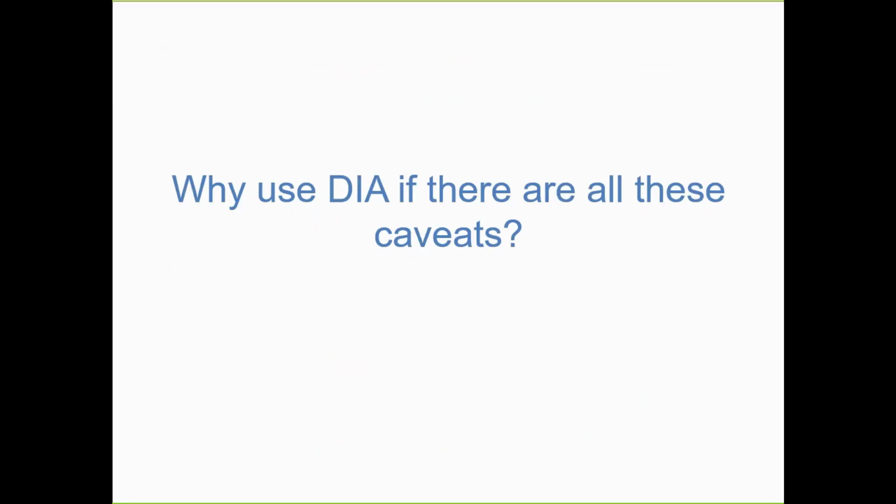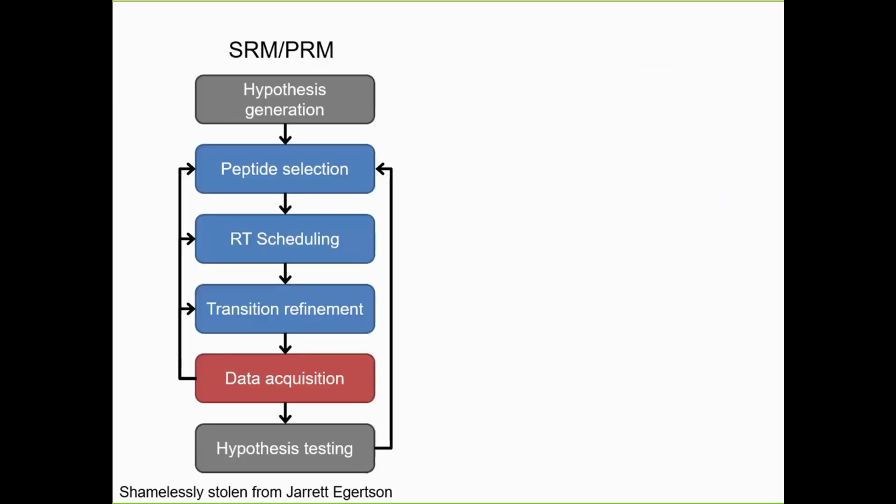So you might wonder, why would we recommend that you consider DIA at all if there are all of these caveats to doing the data acquisition? And I think you need to consider this from multiple perspectives. The first is, why is DIA potentially better than SRMs or PRMs?